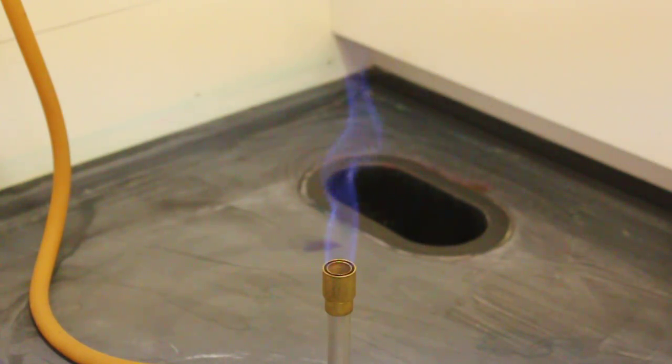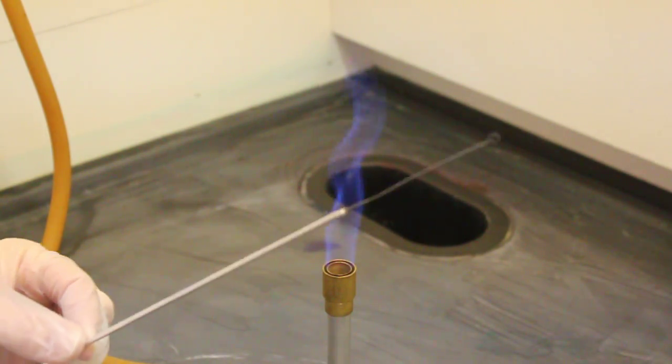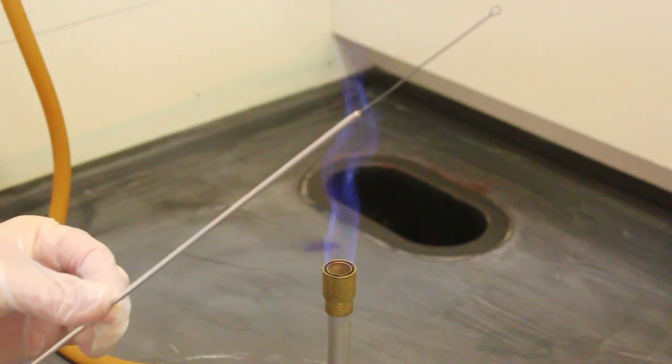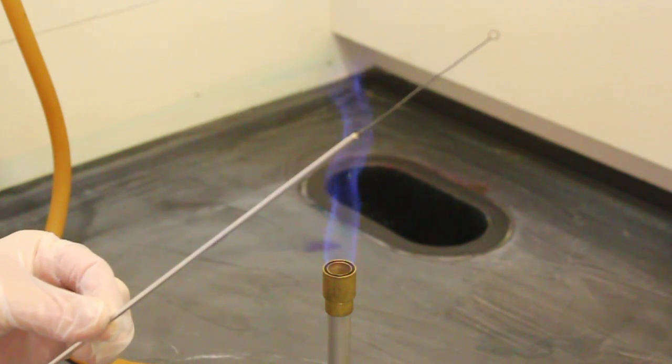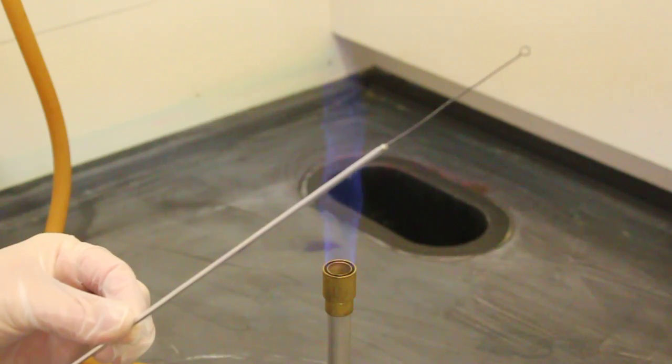I'm now going to demonstrate how to properly sterilize the inoculating loop. This is the inoculating loop that is used to transfer bacteria from one location to another in the microbiology lab.